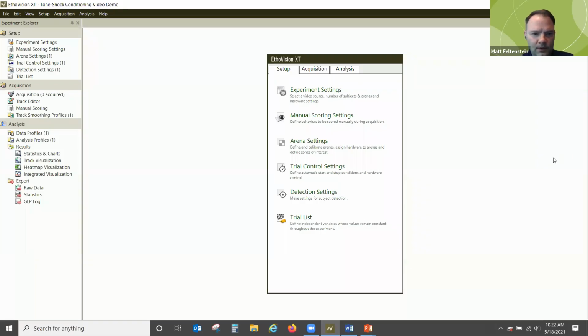Okay, so just want to make sure you can see my EthoVision screen. Yes, yes, okay, yes, thank you. Yeah, sorry, I can't see.